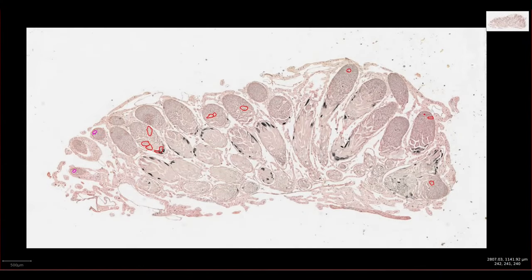Hello and welcome to Down the Scope. Today we're going to have a look at a section of testis from a grasshopper. If you want to have a look at the slide yourself and find the different structures and cells, you can access a digital copy at downthescope.co.uk. A link to the slide is in the video description.